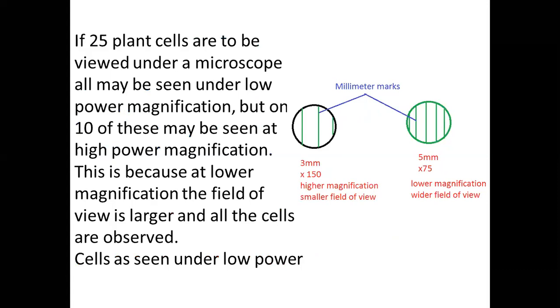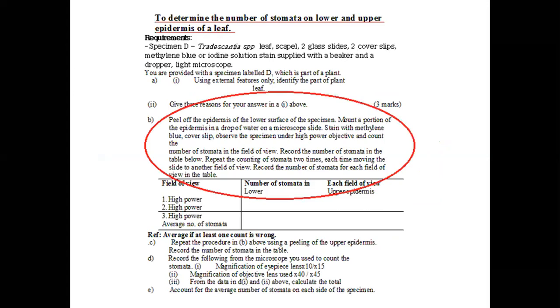Now, I don't want to go on and on about that. Now, let's narrow down to some areas that the examiner may be interested in. Before now we come to what we call microscopy. I'm about to talk about microscopy, the skills that we need to develop so that we can answer questions effectively.